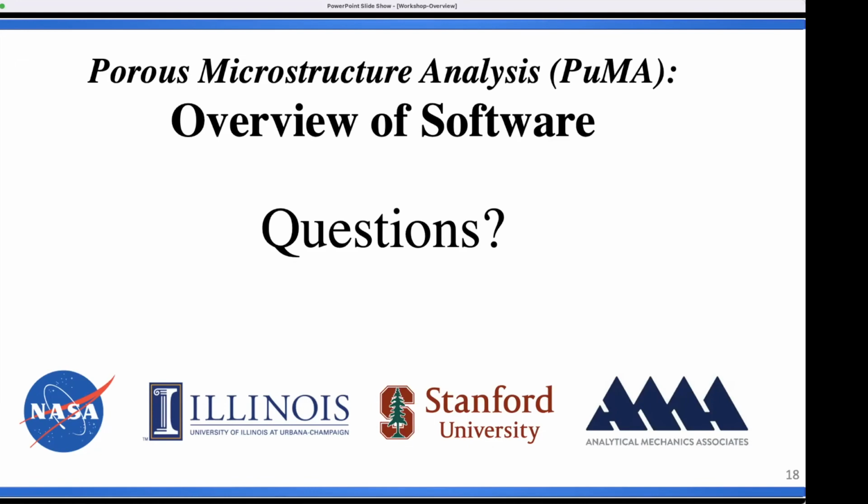are being currently expanded in a project that is only now starting at NASA, which basically aims at capturing MicroCT data of already damaged domains, and then investigating if, with maybe some deep learning segmentation, we can automatically identify the cracks or the defects inside the MicroCT. So that's something that is starting now on my side.